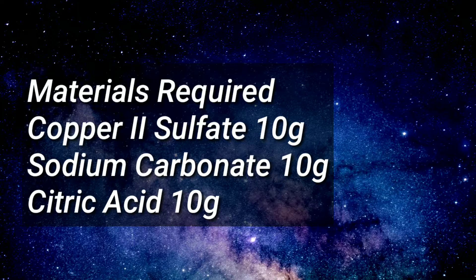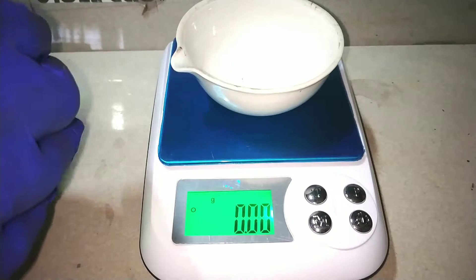Here we prepare it via the copper carbonate and citric acid route. The copper carbonate was in turn produced by the reaction of copper 2 sulphate with sodium carbonate, and these are the materials required for this synthesis.